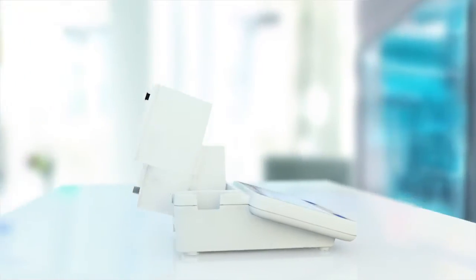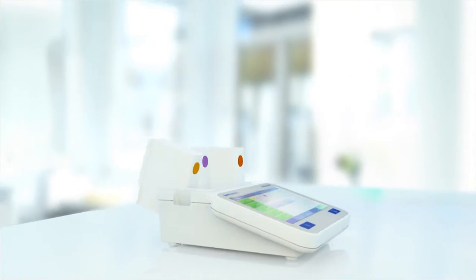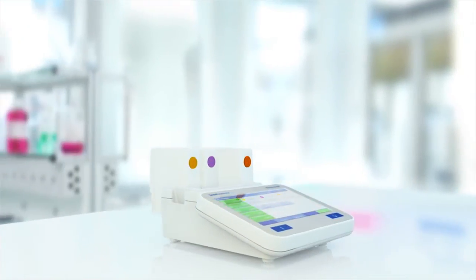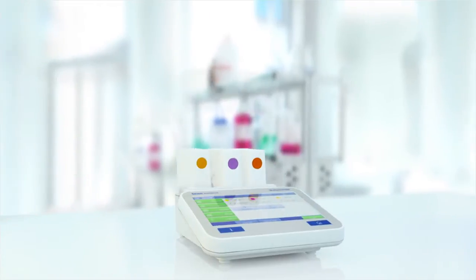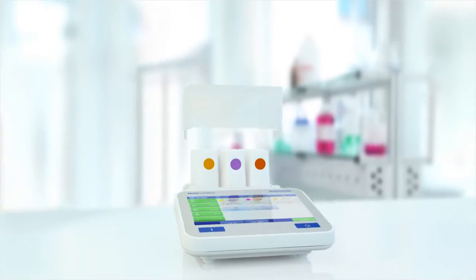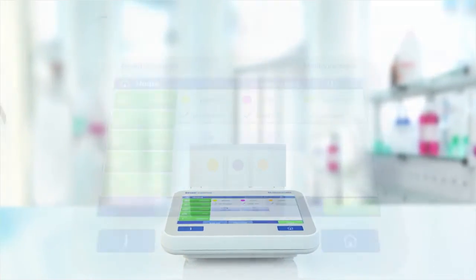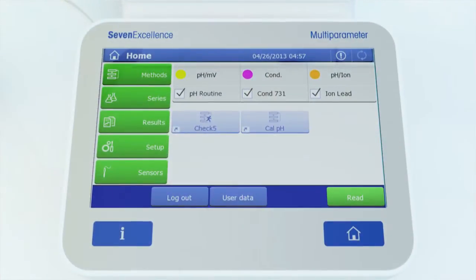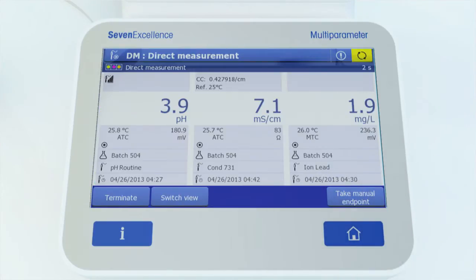Enjoy complete flexibility using any single, dual, or triple channel combination of modules. Up to three parallel measurements can be started with one click.